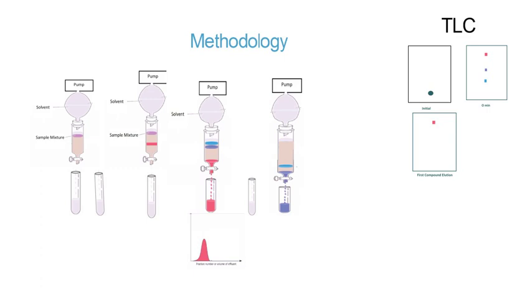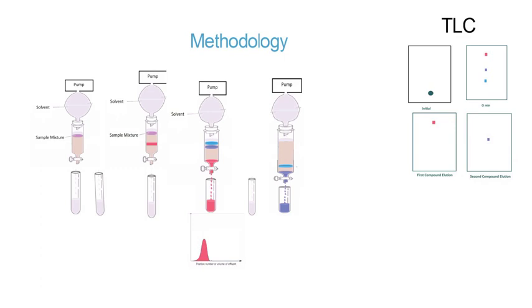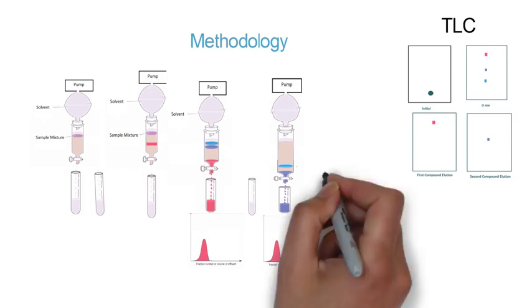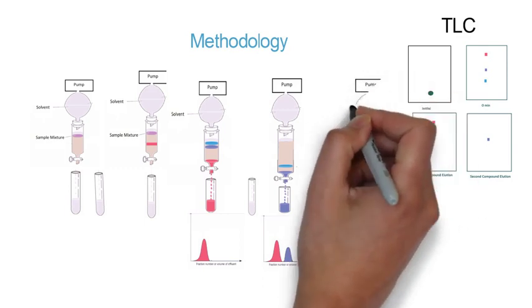After that, the second compound has been separated out, and we can run a TLC of that particular compound. Now we can locate the spot, so comparing the TLC number two, you can see the spot of compound number two, and also you can see the chromatogram. Thirdly, now the last compound has been remaining.